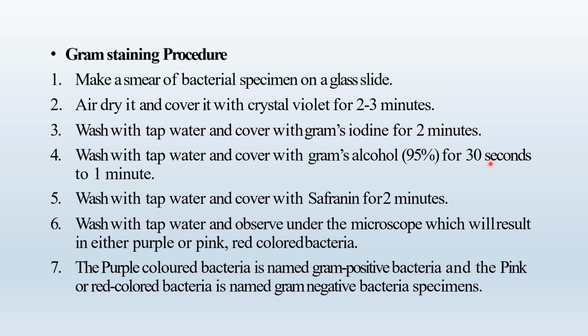for 1 minute, and then washed with water and then covered with the last dye, safranine, for 2 minutes, and then washed with water and then observed under the microscope. Under the microscope, we will see either purple colored or pink red colored bacteria. Purple colored bacteria are called gram positive bacteria, while pink colored bacteria are named gram negative bacteria.